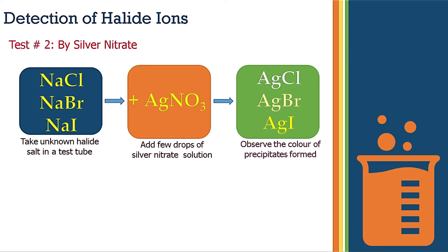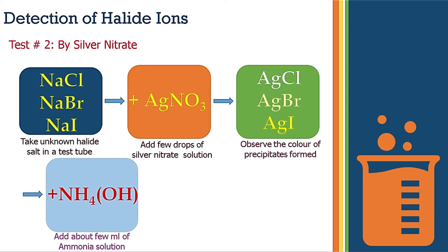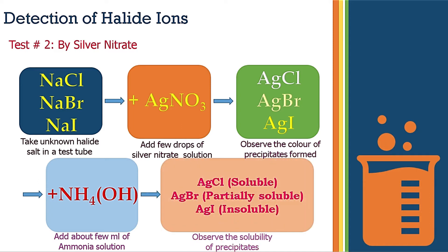You can further confirm the result using ammonia solution. Add a few ml of ammonium hydroxide to the precipitates. White silver chloride precipitates will become completely soluble in ammonia solution. Silver bromide precipitates — the creamy yellow ones — will be only partially soluble. Silver iodide precipitates — the deep yellow ones — will remain insoluble in ammonia solution.